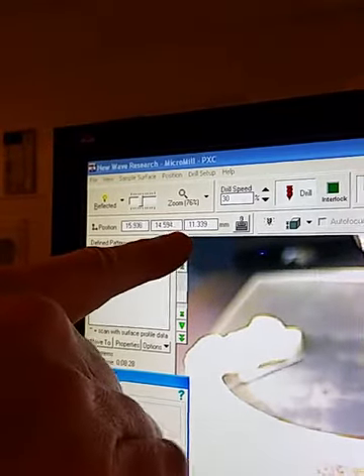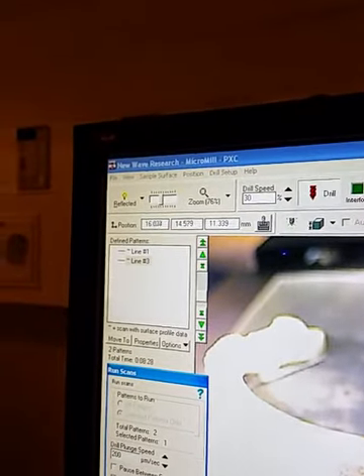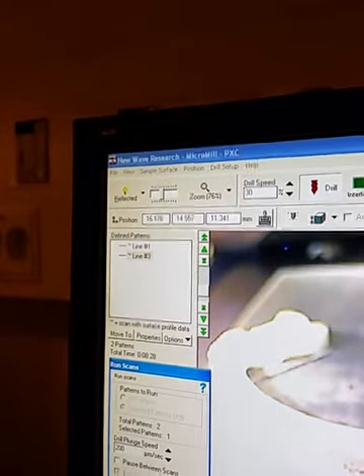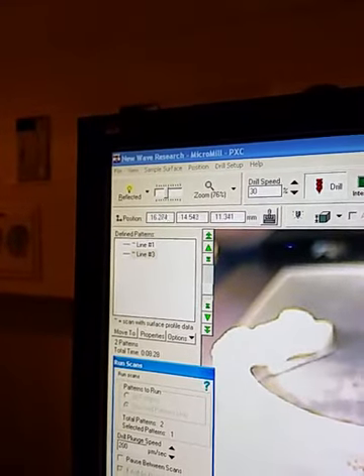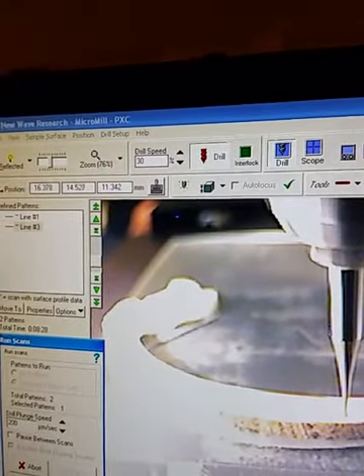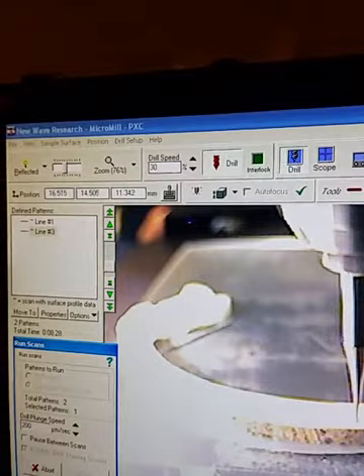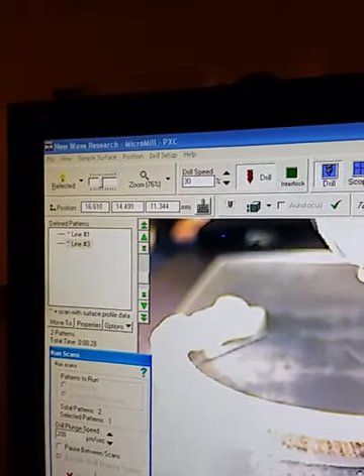Yep, see, the next one's a little bit higher, because it's stepping up slightly. That's why I like to use the Z profile, because I think the machine knows a little better where it is. Yeah. Look. Yep, 41. Because you can choose to just have the machine treat this as a flat surface. You define one point, and then the machine remembers that that's the surface. But if you get a decent variation, then you might drive the drill deeper than you want to go, and it may bind up.